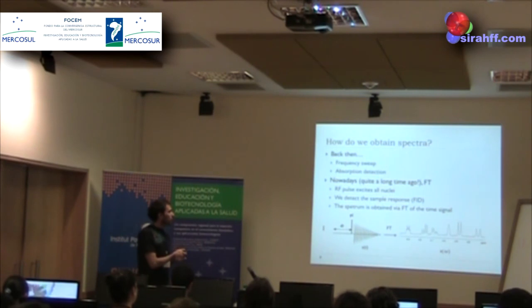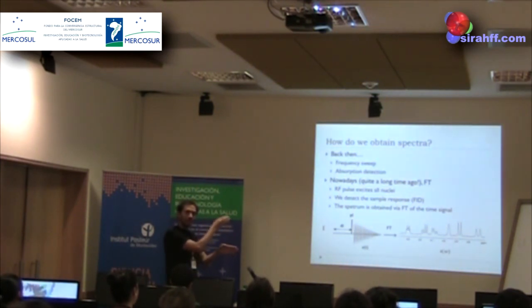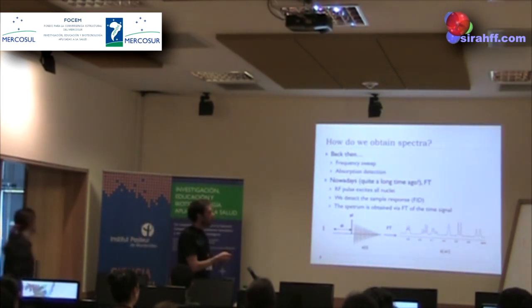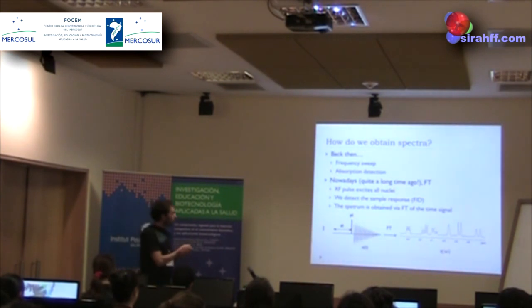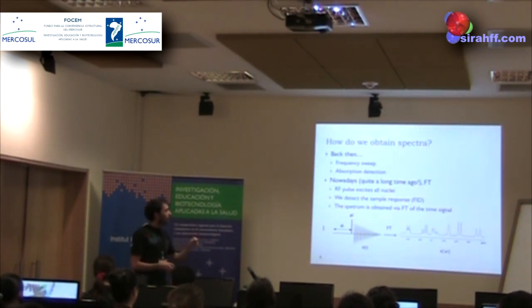FT-NMR was developed. And what we do nowadays is to apply radio frequency pulses that excite all nuclei at the same time. So instead of going frequency by frequency and seeing, well, there's a nucleus here, no, there's no nucleus here, yes here, and drawing the spectrum, we just apply a very intense radio frequency pulse that will excite all nuclei. And then we detect how these nuclei respond to this excitation. They will relax, they will go back to equilibrium, giving us the frequencies in doing so. So when we detect the sample response, we see the nuclei going back to equilibrium in the current in my probe, and we call this response the free induction decay, the FID.